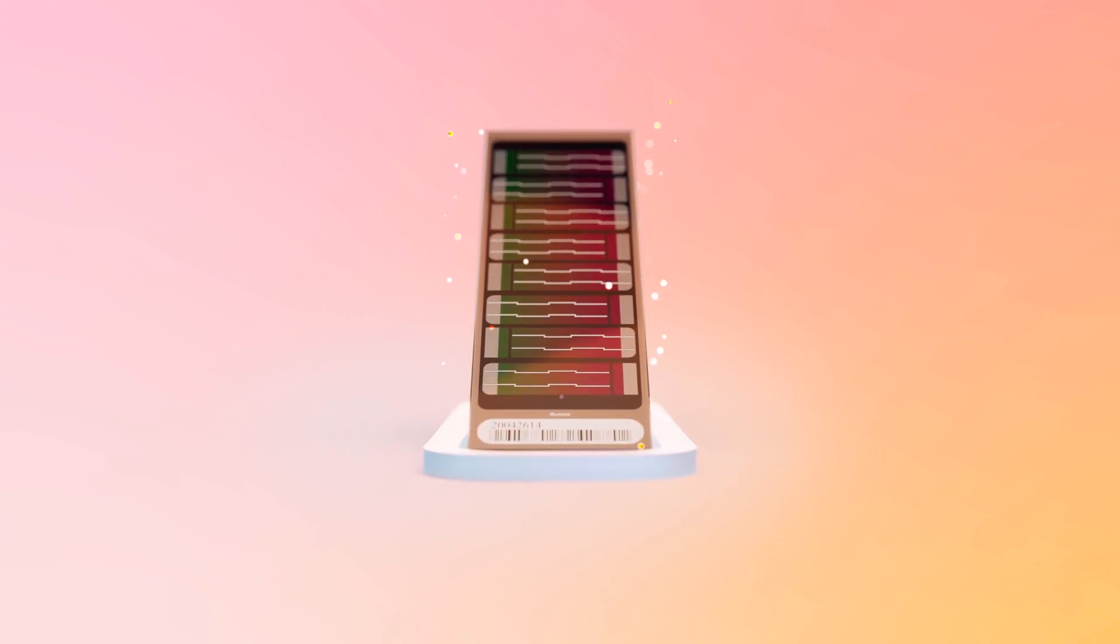It represents the most comprehensive genotyping microarray on the market for supporting pharmacogenomic research in addition to polygenic risk score development, ancestry determination, and genetic disease research.